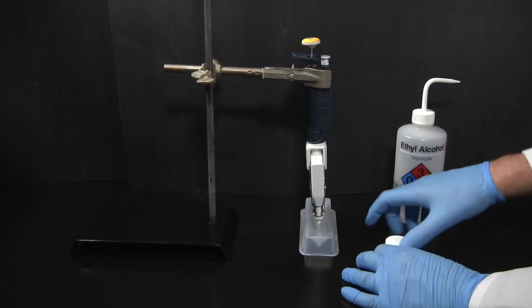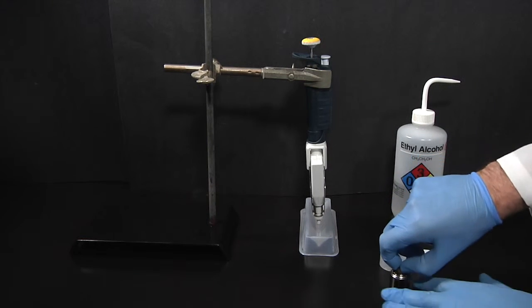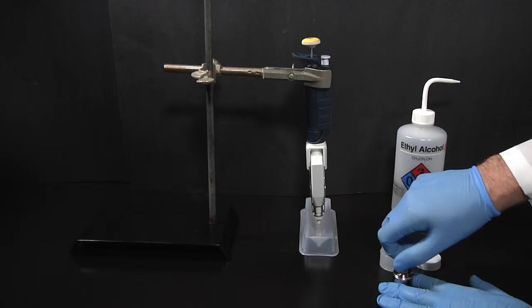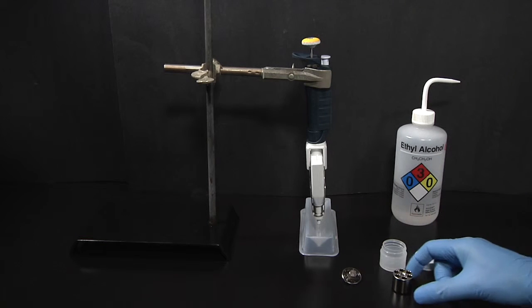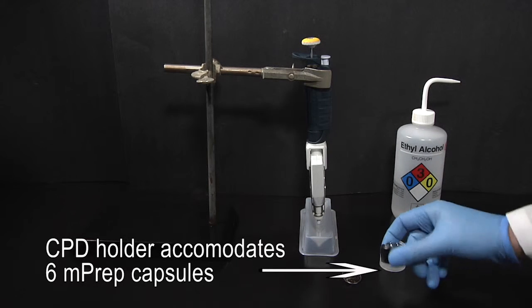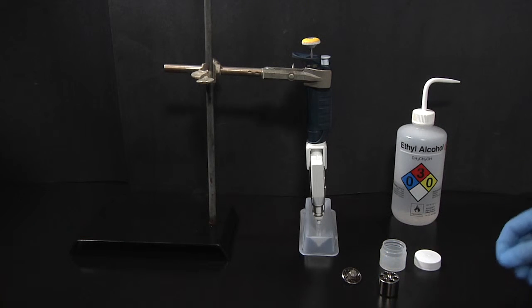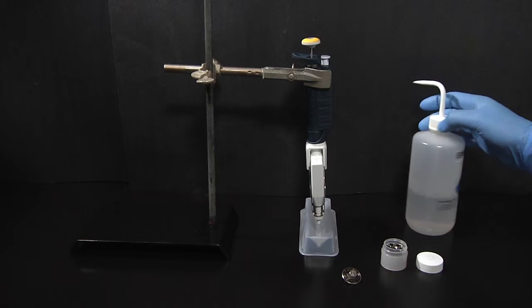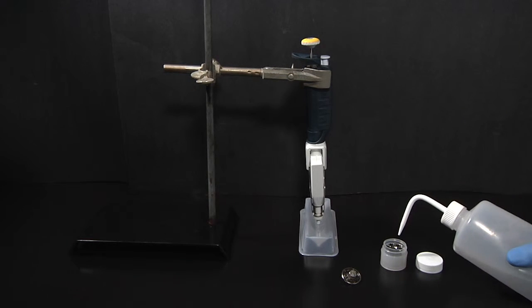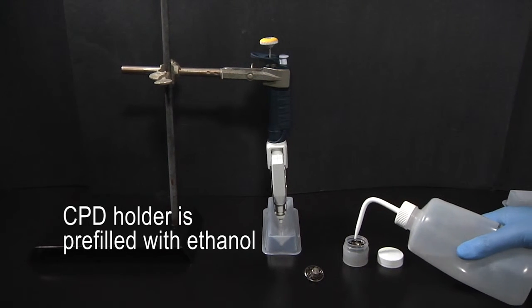After the final 100% ethanol rinse, the MPREP capsules are transferred to the CPD holder. The CPD holder top is removed and set aside. Note that the CPD holder accommodates six MPREP capsules, and note the flow-through design of the holder. The opened CPD holder is placed in a container that is then filled with ethanol in order to keep the MPREP-S encapsulated specimens from drying.